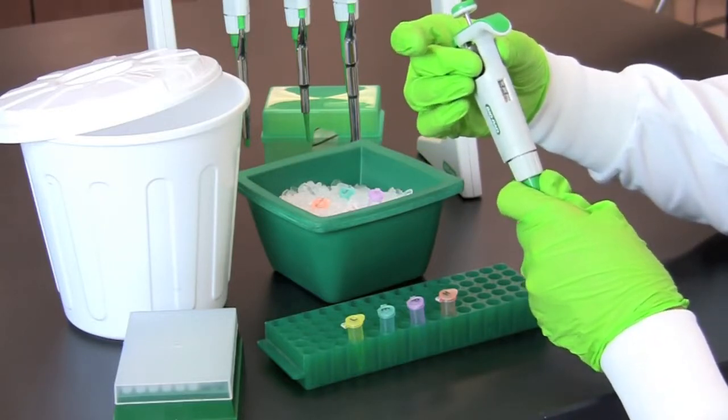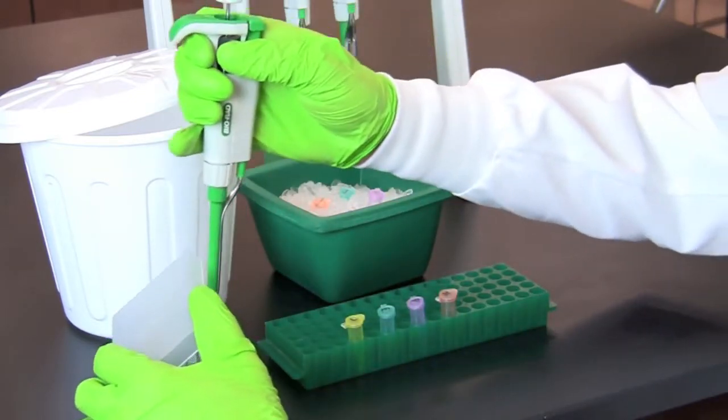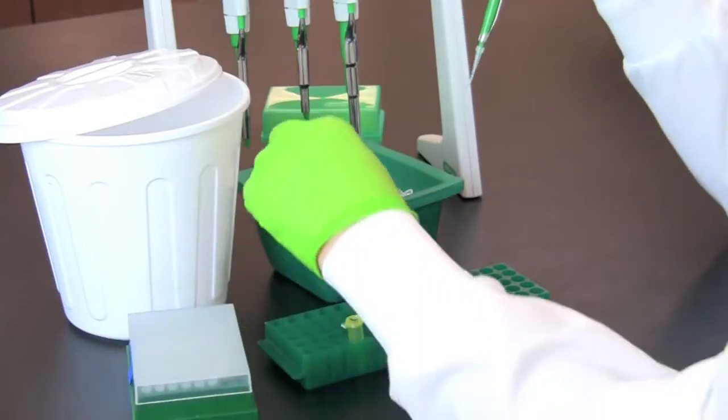Once you have finished transferring four microliters of lambda DNA to each of the color-coded tubes, reset your micropipette and use a fresh tip to transfer six microliters of 2X restriction buffer to the color-coded tube labeled L.